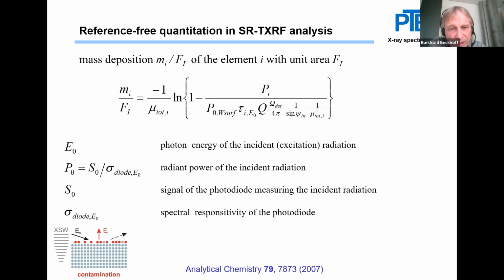And we have a different concept of the solid angle of detection, because this is actually a convolution of the incident beam footprint in conjunction with the angular acceptance that is associated with the detector.